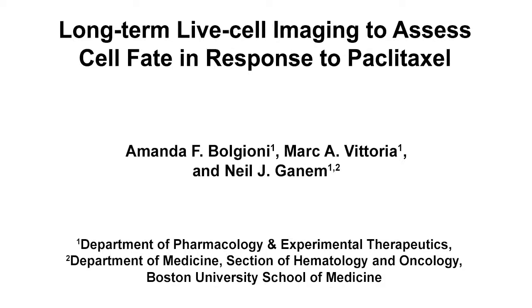The overall goal of this procedure is to use live cell imaging to assess cell fate decisions following treatment with the anti-mitotic drug Paclitaxel. This method enables us to visualize how individual cells respond to different doses of the anti-mitotic drug Paclitaxel. The main advantage of this technique is that it provides a wealth of information on single cells or whole populations that is unobtainable from fixed cell imaging or population-based assays.